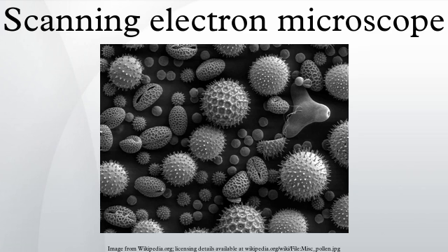Materials: backscattered electron imaging, quantitative X-ray analysis, and X-ray mapping of specimens often requires that the surfaces be ground and polished to an ultra-smooth surface. Specimens that undergo WDS or EDS analysis are often carbon-coated. In general, metals are not coated prior to imaging in the SEM because they are conductive and provide their own pathway to ground. Fractography is the study of fractured surfaces that can be done on a light microscope or commonly, on an SEM.